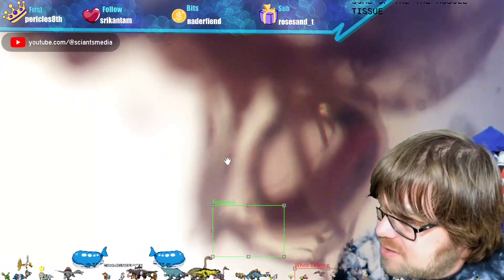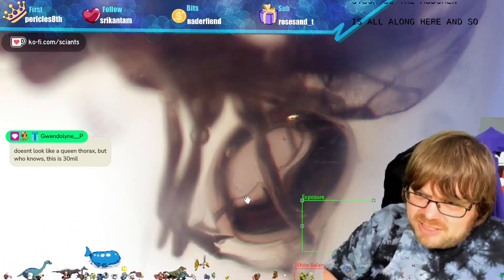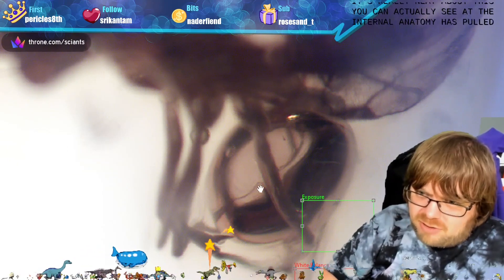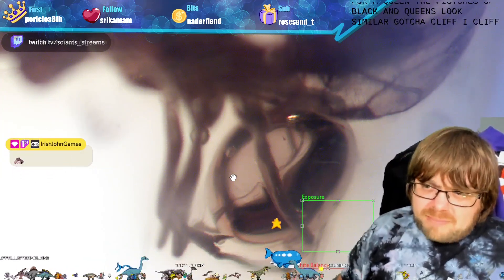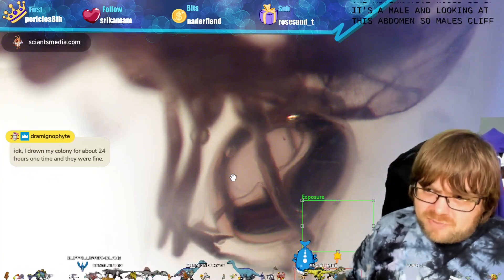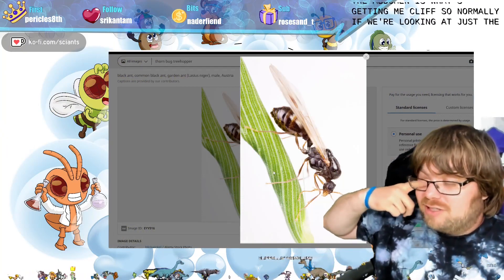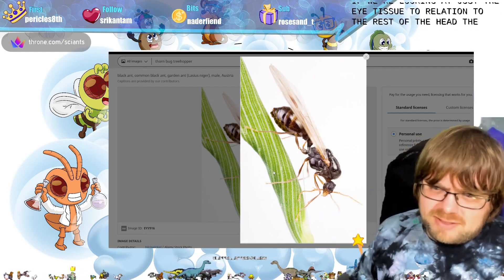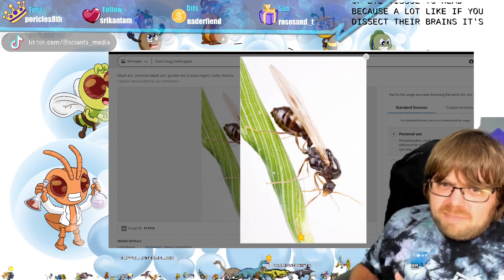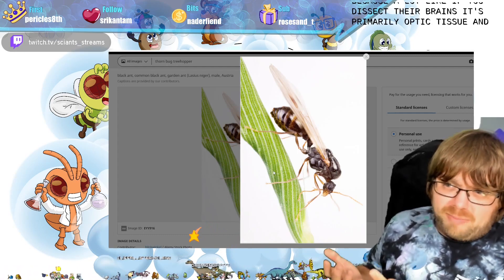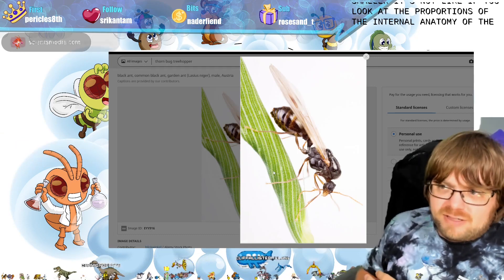The exoskeleton doesn't change as they age, even as muscle tissue depletes. The abdomen appears to be in a bubble - it's all along here. What's really neat is you can actually see the internal anatomy has pulled away from the external. The eyes are very big even for a queen, but pictures of black ant queens look similar. The alternative would be a male - males will usually have bigger eyes relative to the rest of their head. The abdomen is what's getting me; males have the biggest ratio of eye tissue to head.